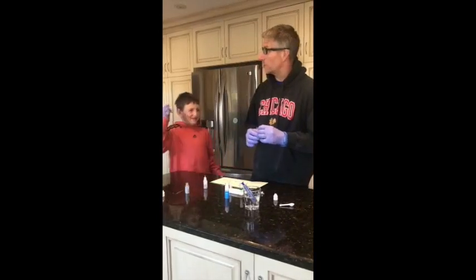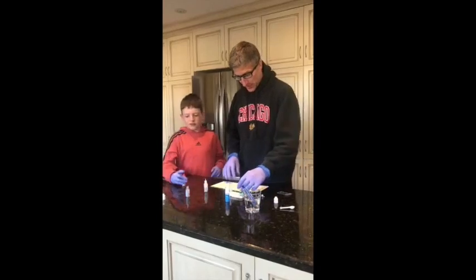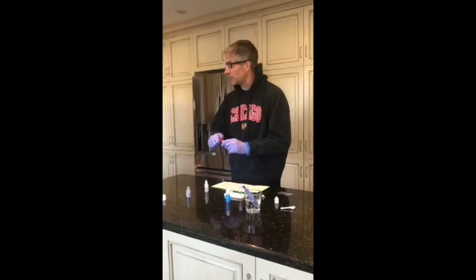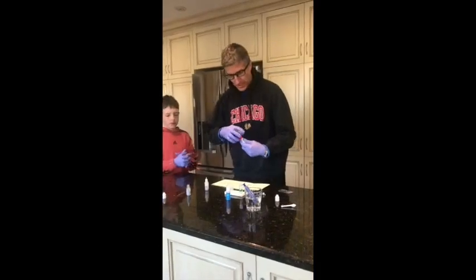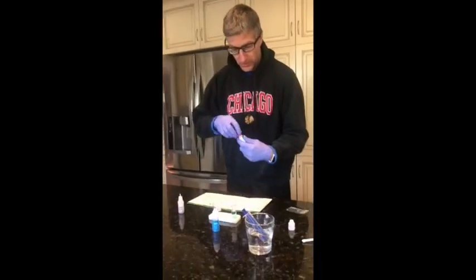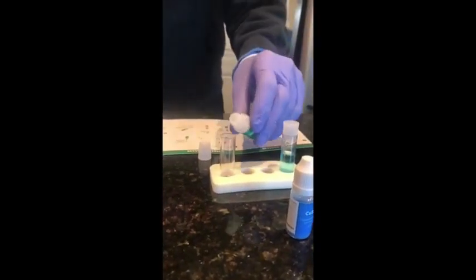So when the timer goes off, we're going to pour that roughly same amount, thank you, Duncan, into our other test tube as the copper sulfate solution. Just have to get this off. Oh, there we go. That's why we have gloves on.